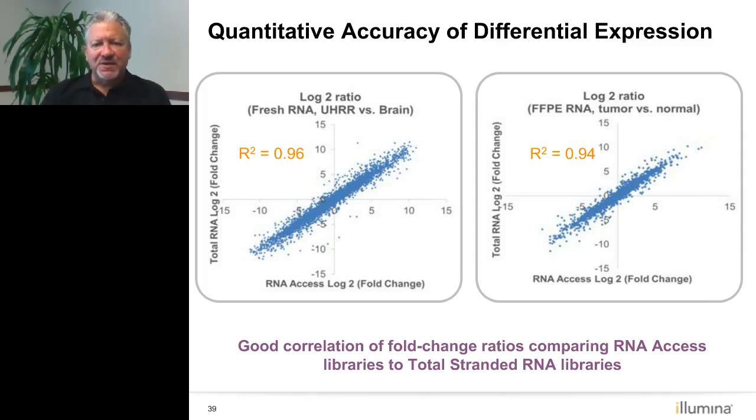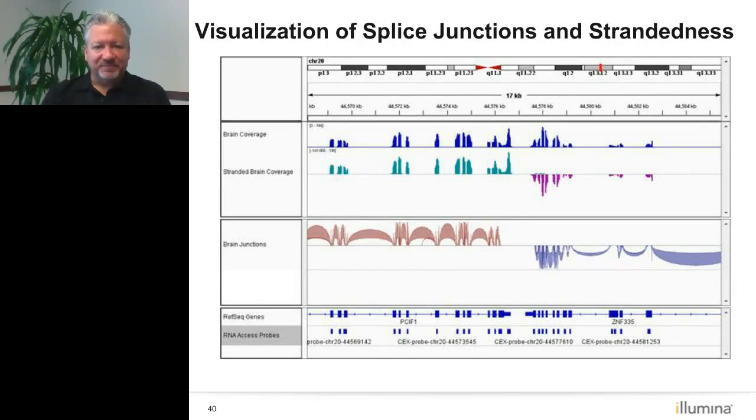And so once again, we really have seen zero evidence or data to support the fact that the enrichment process is in any way biasing the samples. Of course, it does bias it in terms of you get what you probe for, but it doesn't bias it in terms of the quantitative nature of what it's capturing.